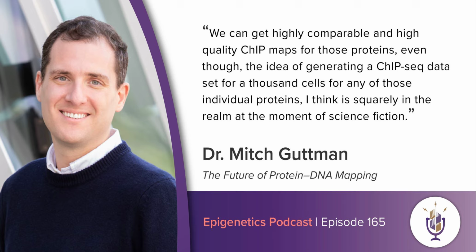So I think the answer in terms of the number of cells will probably depend very much on the nature of the pool. So for 20 to 30 histone modifications, I would imagine one can even go lower than 50,000 total cells and get high quality maps. For 20 to 30 rare, low abundance transcription factors, in reality you'd probably want more than 50,000 total cells to be able to get really high quality maps, maybe on the order of 1 million total cells. And that may also depend on the cell type and the specifics of the cell types themselves, which obviously may vary. Will that be a limitation?